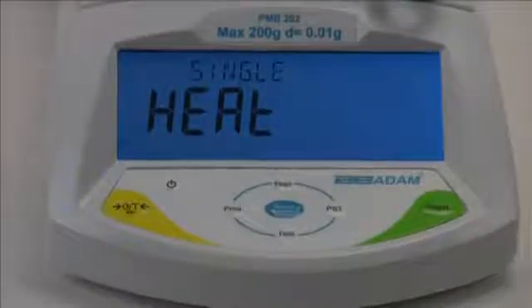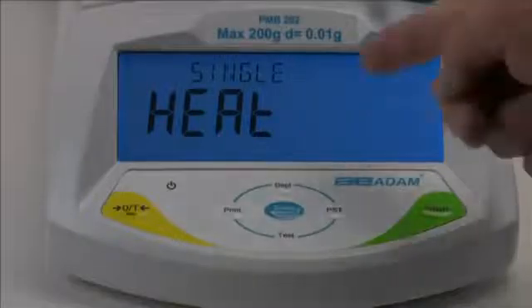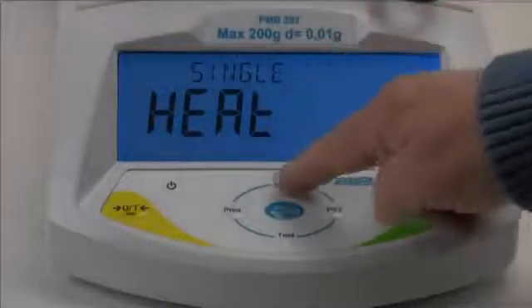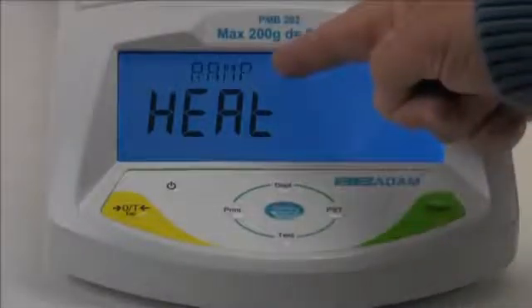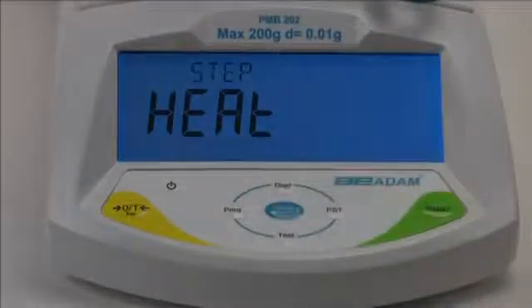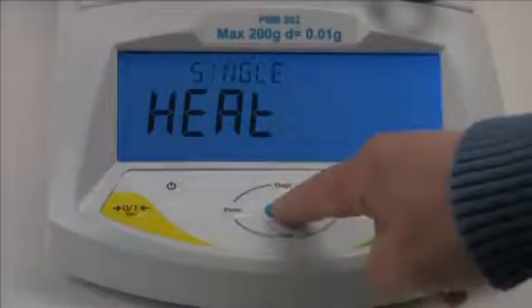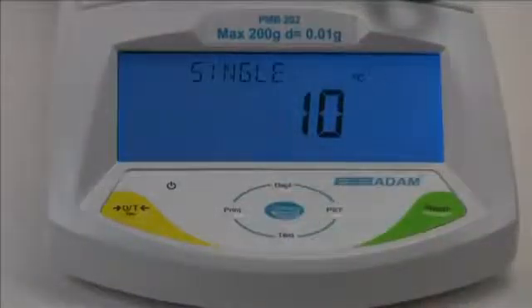Now we need to select a method of heating. The PMB offers three methods: single temperature to heat your sample to a set temperature; ramp to gradually reach your final temperature in a specified amount of time; and step to use up to three different temperatures during the test. We'll select single for our test by pressing enter when single is displayed.